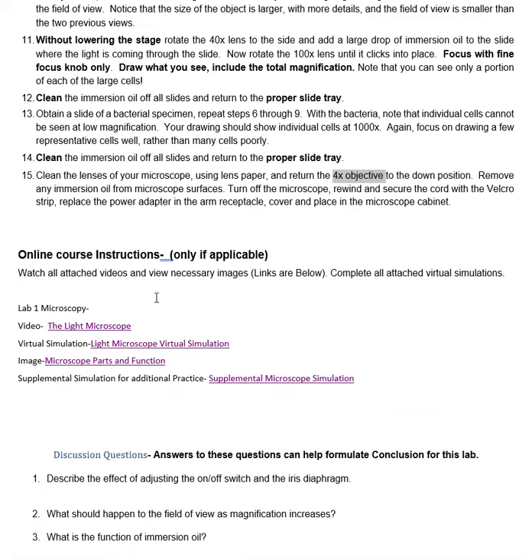This is really good. That's those amoeba sisters I told some of you guys about. This is really good. It's going to give you a way of practicing doing those steps. This is a really good one as far as the parts of the microscope. A little practice. And this is another simulation. I would do both of these. Now, in order to get here, you can see when I hover my cursor over it, you do Control and then a left mouse click and it'll take you there.